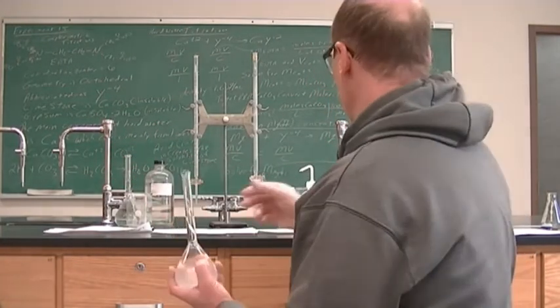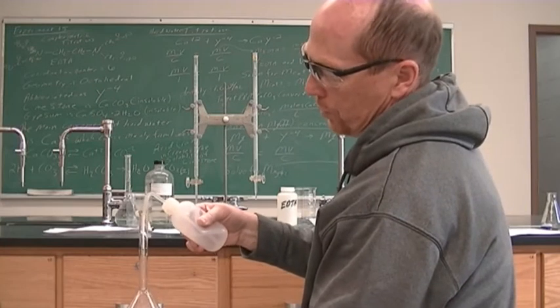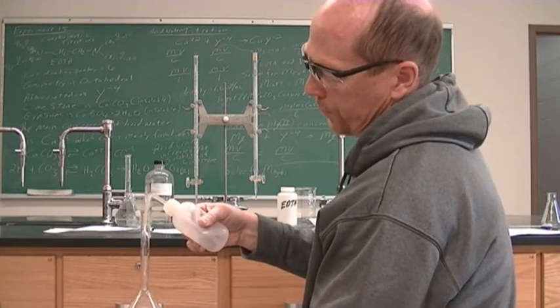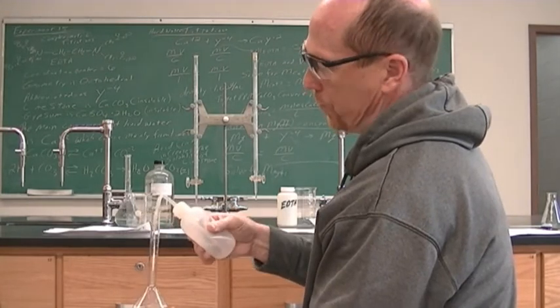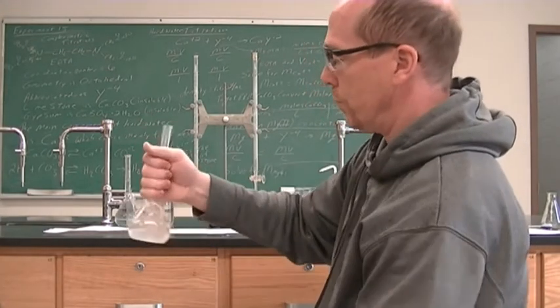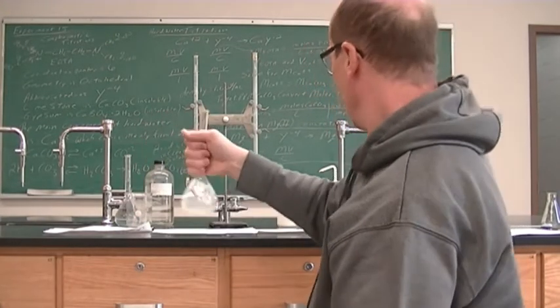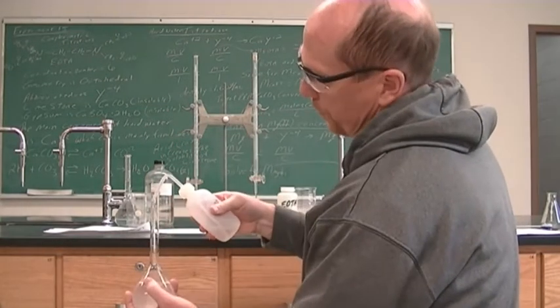All right, so I'm just dissolving the EDTA. It's looking pretty good. Fill up the deionized water here, using it all up.